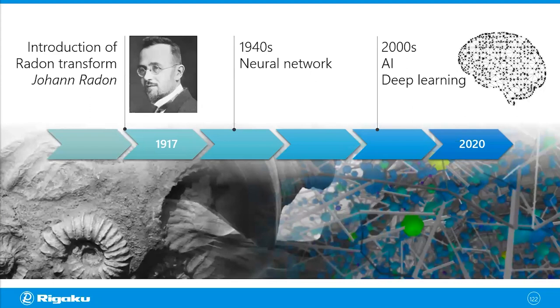All the AI-based image segmentation algorithms, such as machine learning or deep learning, became available only recently. And the computers were not really fast enough to deal with gigabyte-sized images before, but now they are getting there. So I think now is a really good time to take a fresh look at what X-ray CT can do. And if you're new to X-ray CT, I hope that you saw something interesting today and you will start thinking about using X-ray CT for your research.